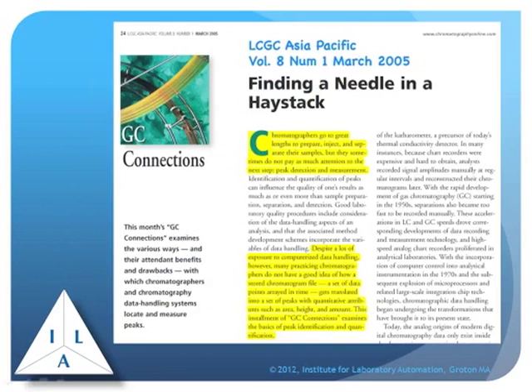One point that has to be addressed when we start looking at samples like this, and as we move into the digital realm instead of just working with our hands-on equipment, is the ability to properly manage and understand how to use these systems. This is an article that was published in March 2005 on chromatography, and if you look at the yellow area on the bottom, the author talks about the fact that even though people are well schooled in how to do the analysis, they don't understand how to deal with the data. They don't understand how the computer system draws baselines, carries out the analysis, how the work is done. All they know is the signal goes in one end and numbers come out the other.